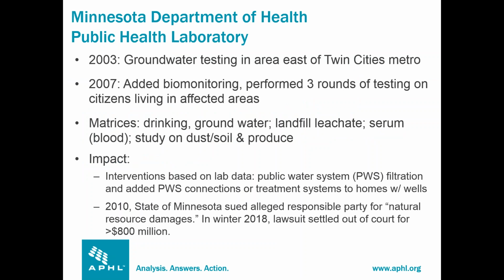So first, with the Minnesota Department of Health Public Health Laboratory, they started doing groundwater testing in 2003 in an area east of the Twin Cities Metro. It was suspected that it may have been contaminated by a large PFAS manufacturer. In 2007, they added biomonitoring and performed 3 rounds of testing on citizens living in the affected areas.